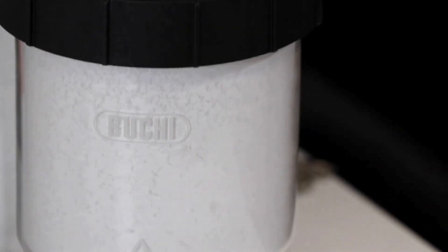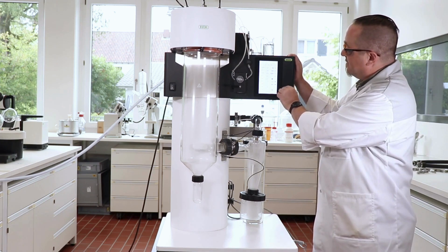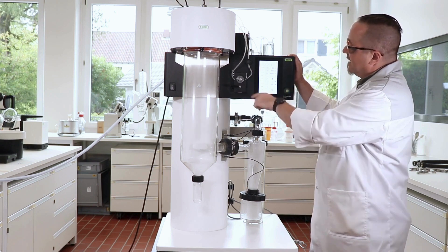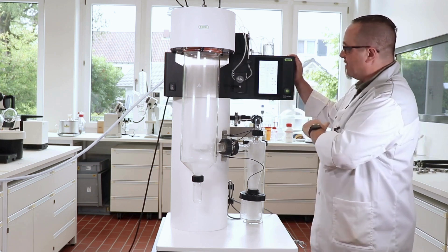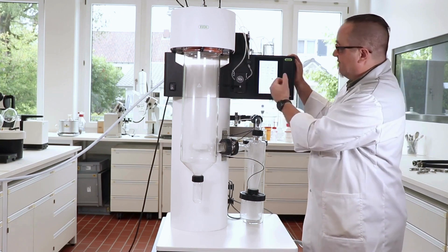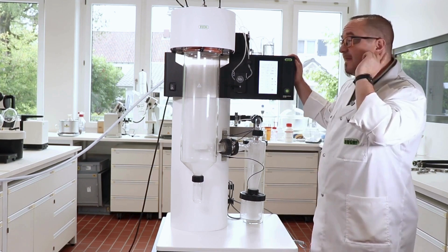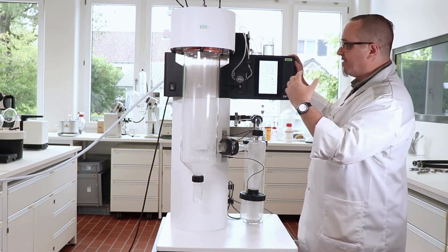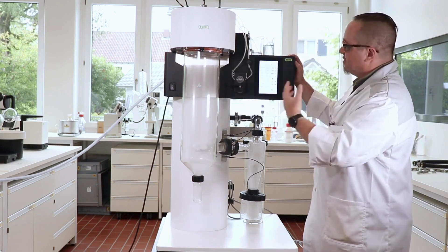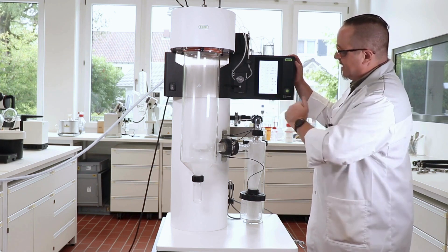Now you can see that we already have deposits in the spray dryer — this is my sample getting down to the product-receiving vessel. When we need to maintain or change some values, we have this knob to turn the value up or down. For example, with the screen cursor on drying gas, we press once to enter edit mode and can turn the knob to about 26 and confirm. You can even hear the aspirator giving higher energy and more airflow through the system. This is possible with all the values selectable on the screen.